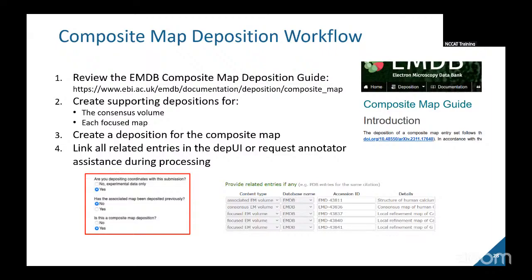Yeah, and it's interesting if you go back. We started seeing these trickle in 2022, and now we have many of these cases. But if you go to the early ones, about the time that we were really getting the policy in place and enforcing it, you have cases where people just took one deposition and put all the additional files there. And the point you're making really hits home, because you may have multiple masks, multiple half maps, and depending on how precisely those links are, it can be a lot of work to figure out.